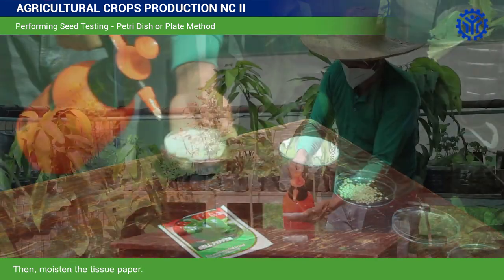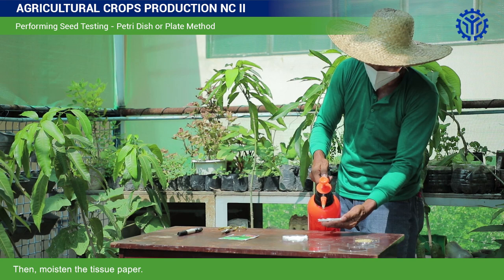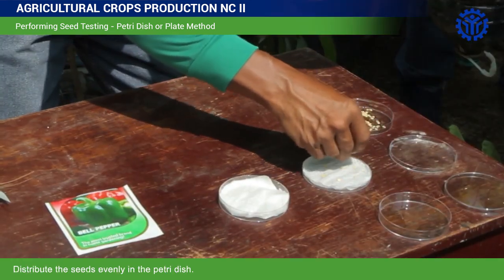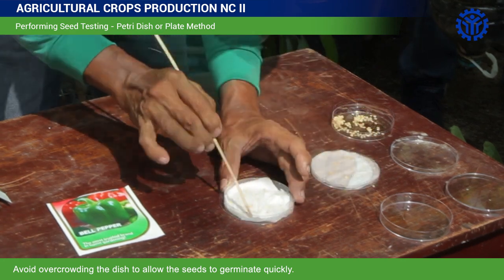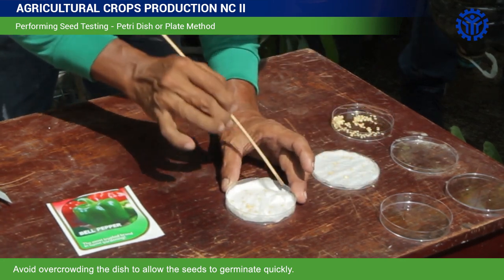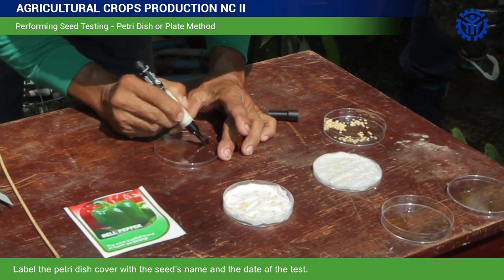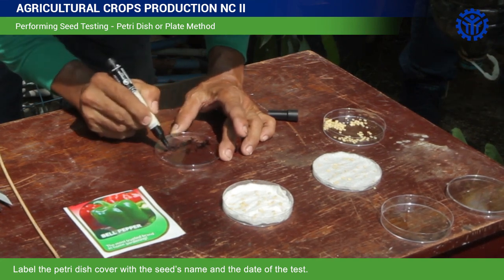Then, moisten the tissue paper. Distribute the seeds evenly in the Petri dish. Avoid overcrowding the dish to allow the seeds to germinate quickly. Label the Petri dish cover with the seed's name and the date of the test.